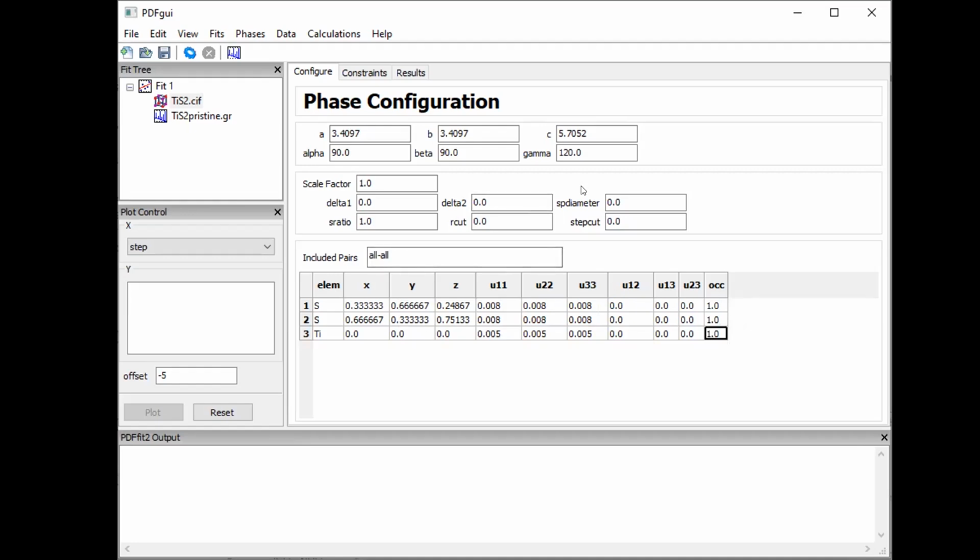Okay, now we input everything we need into the software, and we can start thinking about what parameters we want to define, right? In fact, in the process of fitting the nickel standard, I already mentioned some of the strategies. Since this is basically based on linear regression, the starting point is important, because that relates to whether you can really find the global minimum.